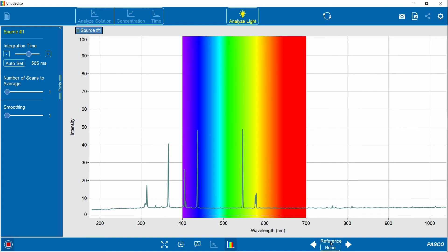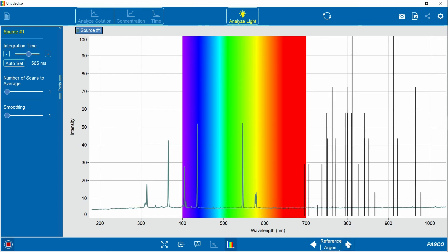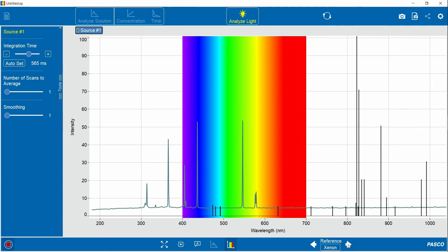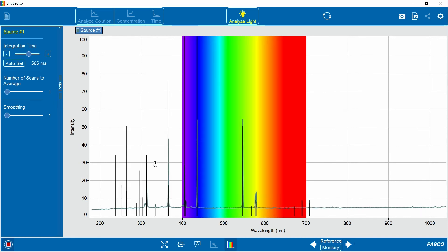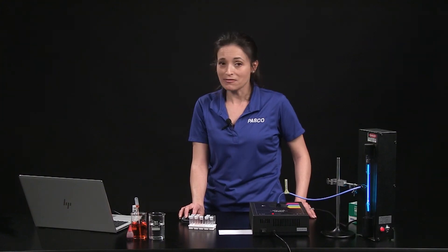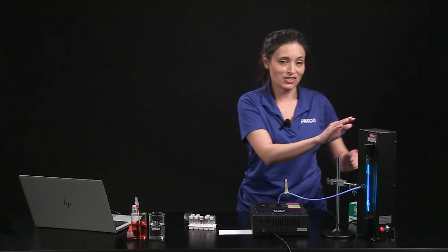And now I can run through the reference lines for known elements. Here's hydrogen, which does not match my data. The next one is helium. It does not match. And argon does not match. Neither does xenon. But mercury does match. So these reference lines help you identify an unknown element from a gas discharge tube.